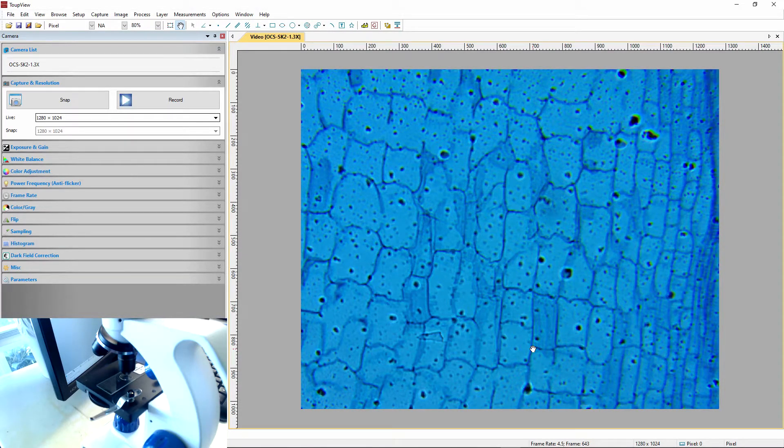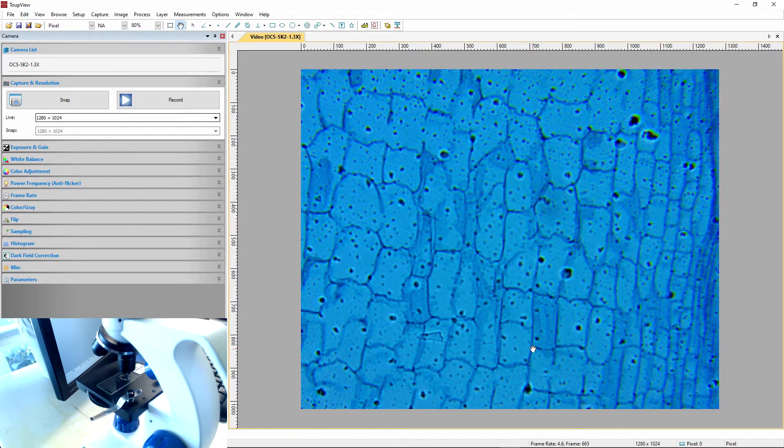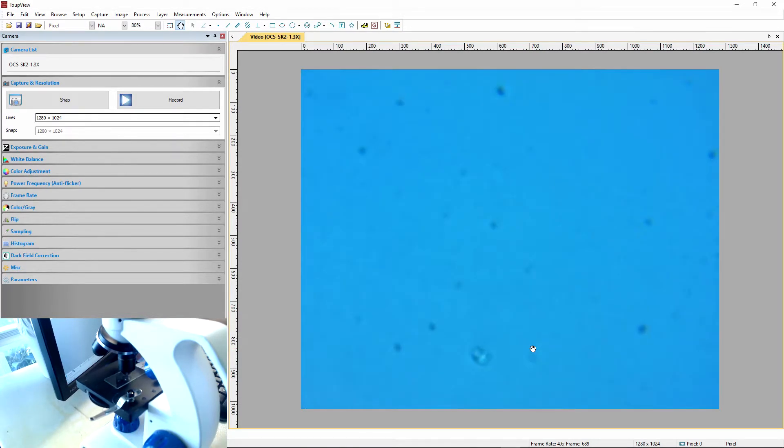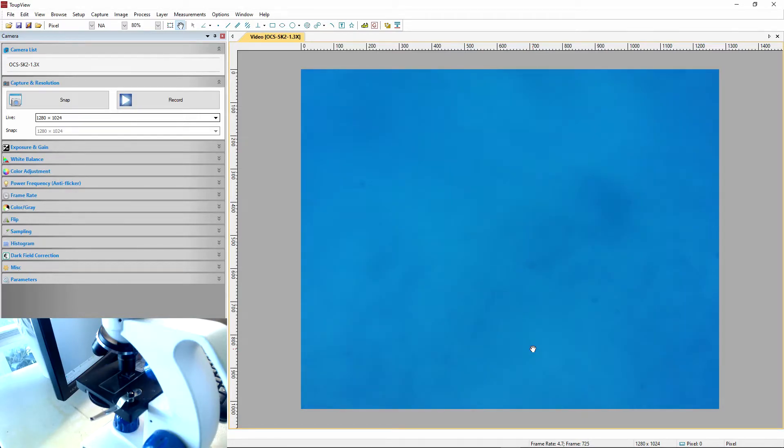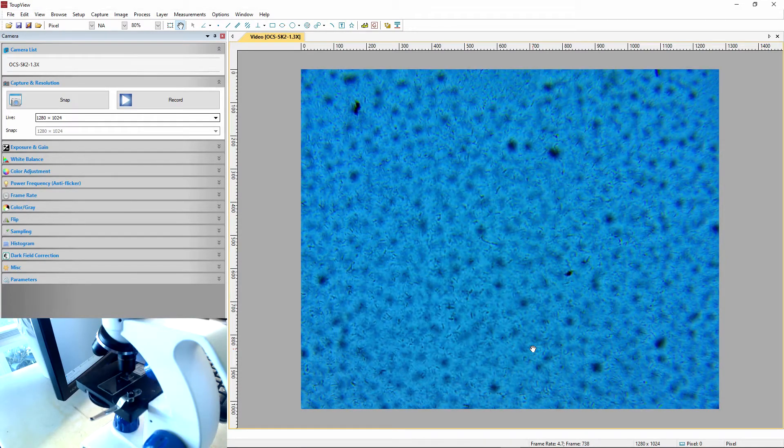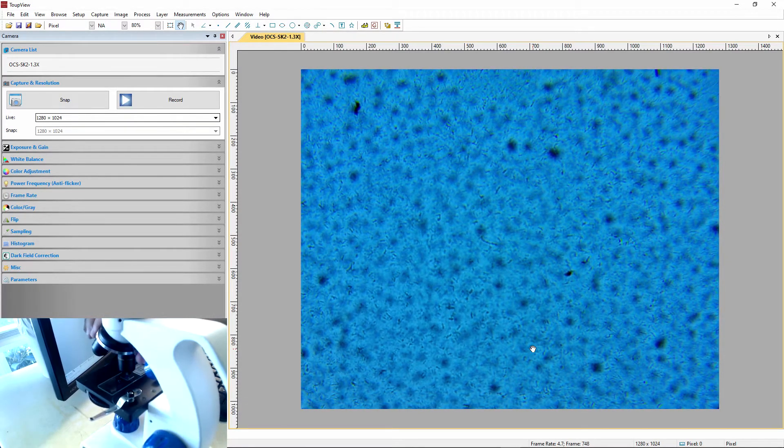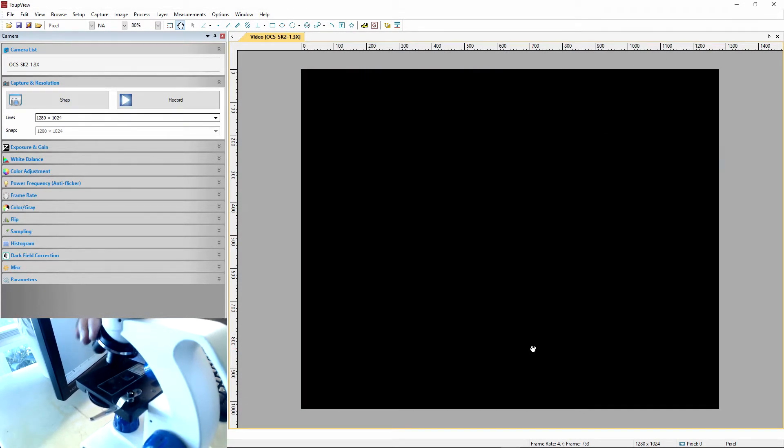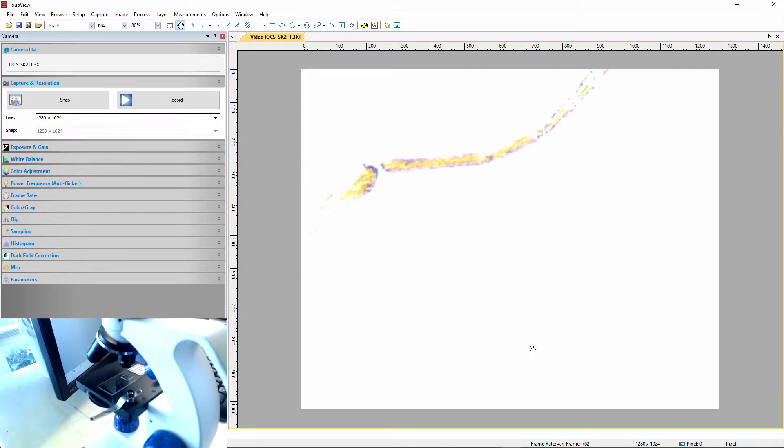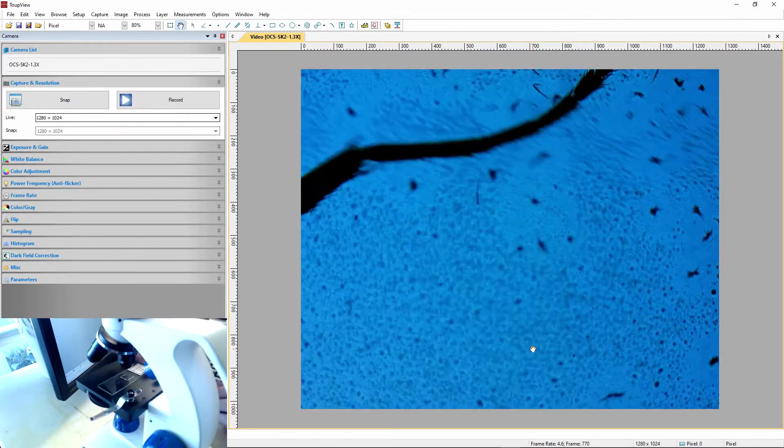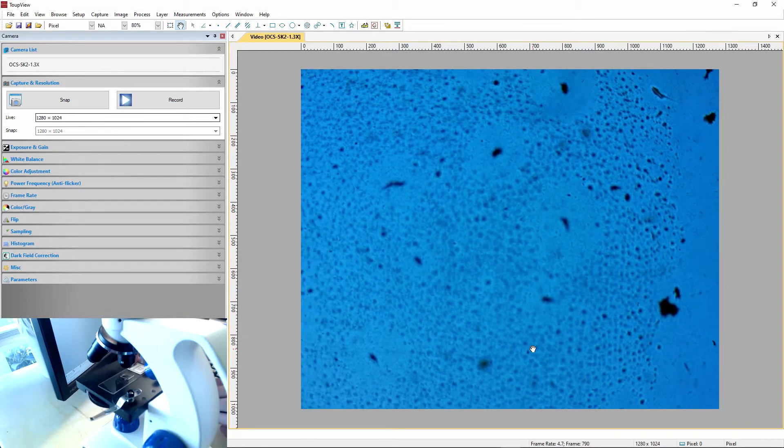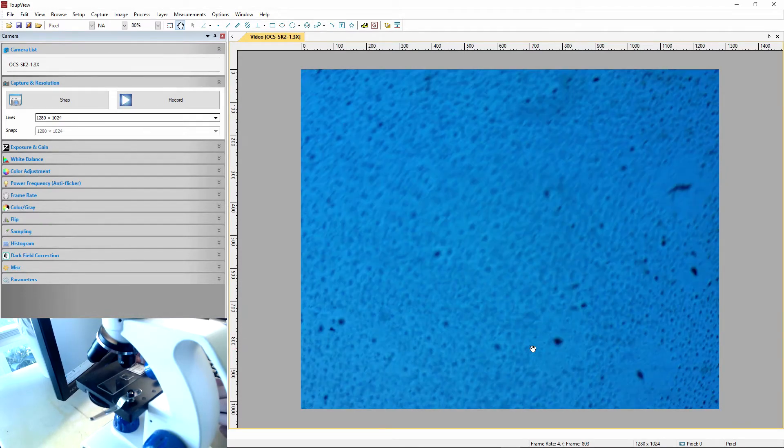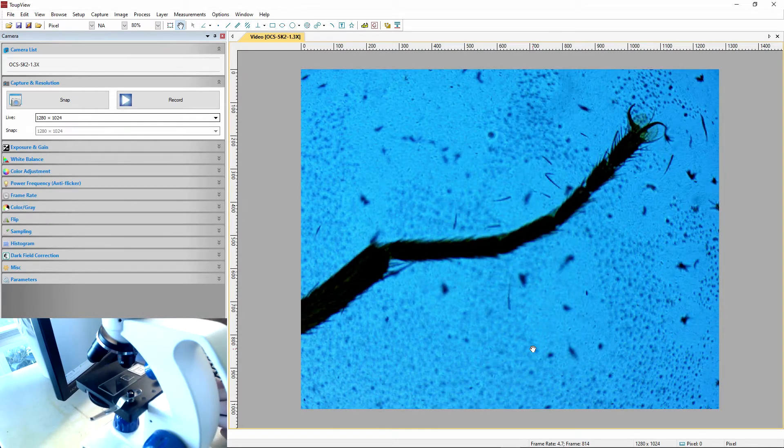Probably a bit better ones I could find. I'll try and do living things. Oh, here's something. Try this. There we go. It's a housefly leg. There we go. Let's see if we can see it. Oh, this one we can make the lens a little bit smaller. Here we go. It's very bright. Oh, it's already in focus. It's got a fun... Oh, no. I lost it. There it is.